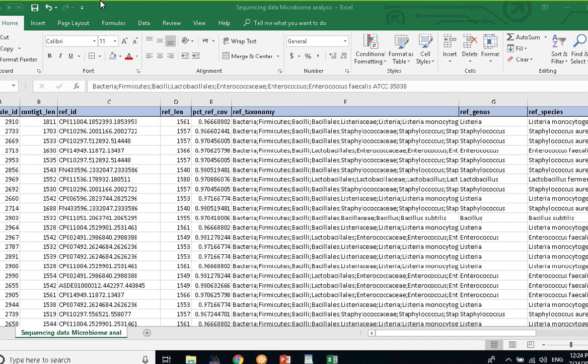And if we were to send you extracted DNA to perform the entire analysis? Yeah, so for the service-based option, it really depends on several parameters, as you can imagine. For example, how many samples you want to process, and even more importantly, how deeply you want them sequenced, because that will affect the sequencing cost. So obviously, the service option would be more expensive, but I can provide you with specific quotes if you share that information with me offline. For example, number of samples and the depth that you want sequenced, and then I can share a quote with you.